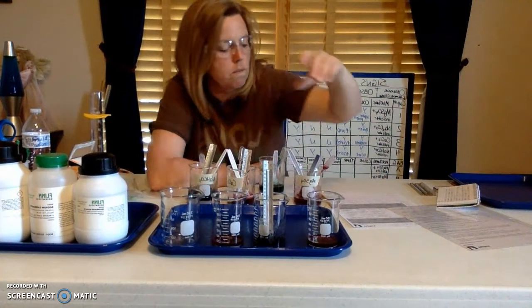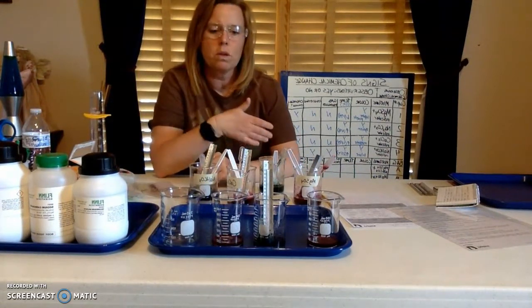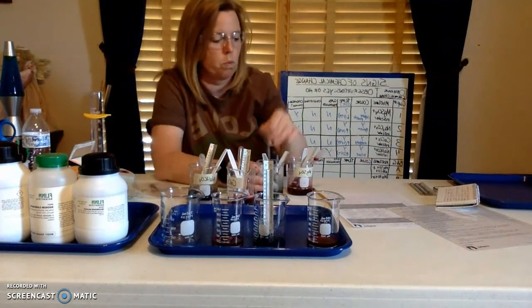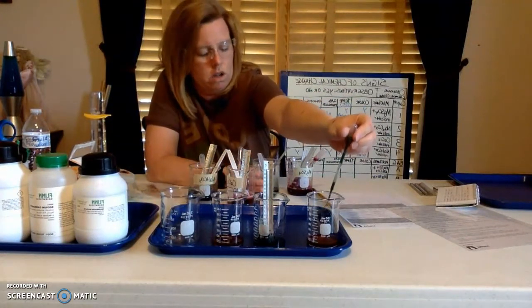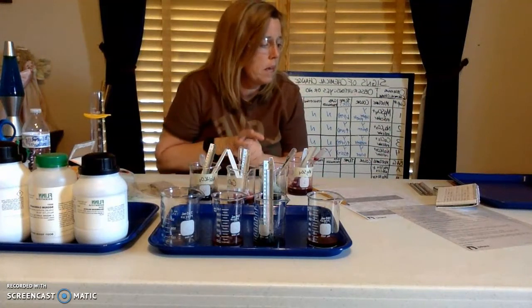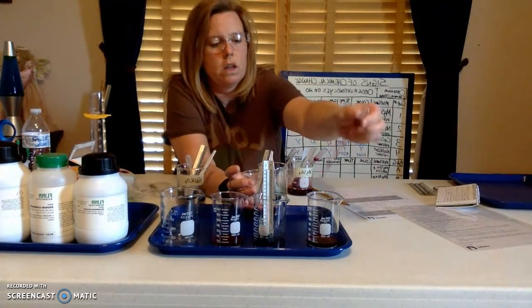It's like a sludge. So again, you're going to ask yourself, are we getting a color change? Are we getting a temperature change? Gas produced, precipitate, and chemical change. I will conduct this as I'm videoing for you today, but I just want you to be able to see it. And I just put the wrong chemical. That's kind of cool. This one was supposed to go here. Oh, I just did the same thing. That's okay. All right, and then into baggie B, we were supposed to have added calcium chloride, so I'm going to jump back because I put it in the wrong beaker, not a big deal. I'm going to jump back and put this into beaker A.